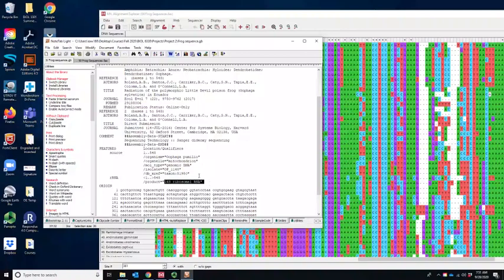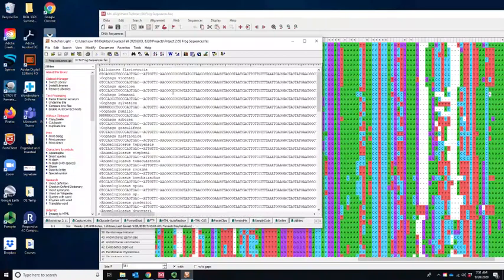Now, a simpler format is a FASTA format. And you can input some data into this, but you don't need to. So basically, FASTA is a bare bones, simple format. And the way it works is you have a first line that begins with this greater than symbol or caret symbol. After that, you can put whatever information you want in a long, long string of lines. So all I have is the genus and species here. But if I wanted to, I could include information about, and you can put spaces in or whatever, but 16S, and I could put the name, I could put lots of information here. And then this would all be uploaded as a name, but with that information embedded in the name.